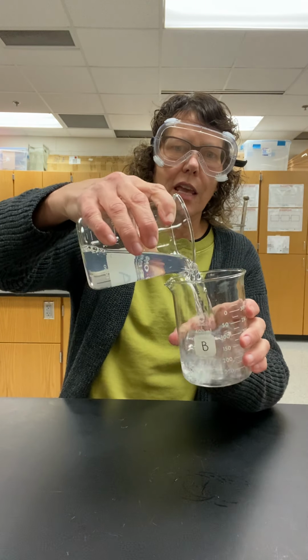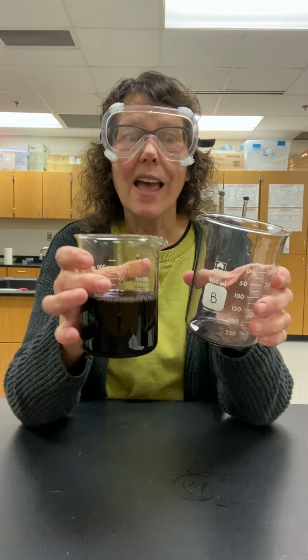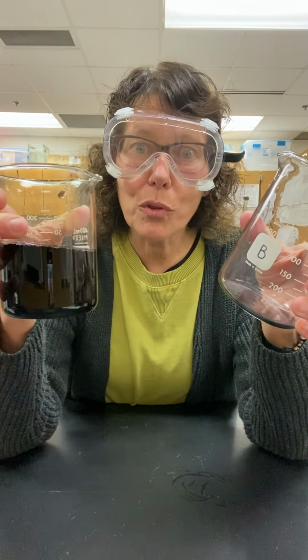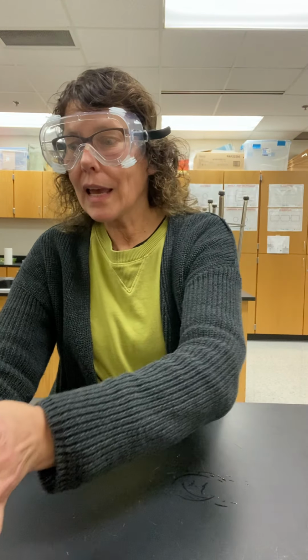Science is not fake. We don't make up tricks and show you stuff and tell you that, oh my goodness, look at what just happened. Everything turned dark. Everything in both beakers all at the same time. Even this drip is dark, right? So what the heck happened?